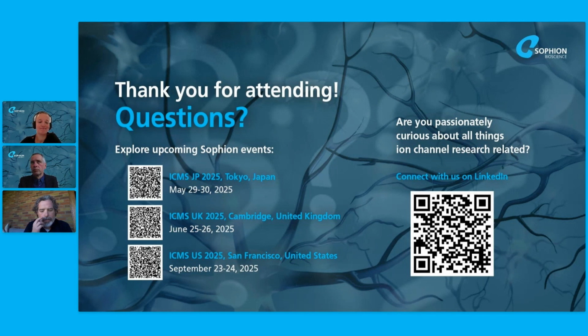Yeah, I can just add, from a monoculture or a co-culture perspective, these can be cultured for extended amounts of time, 4, 5, 6 weeks. With respect to the dissociation, Kadla mentioned that it gets more complicated as the cells age because the networks and the projections get more complicated. So it can be hard to retrieve single cells, but yeah, you can culture them for multiple weeks in monoculture.